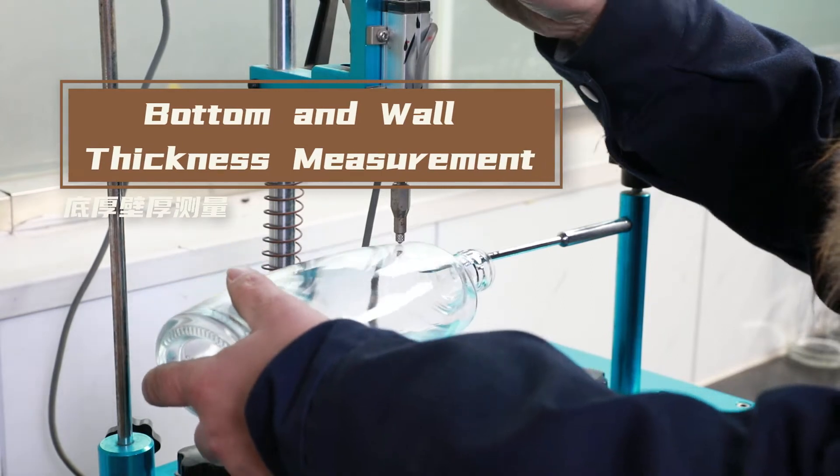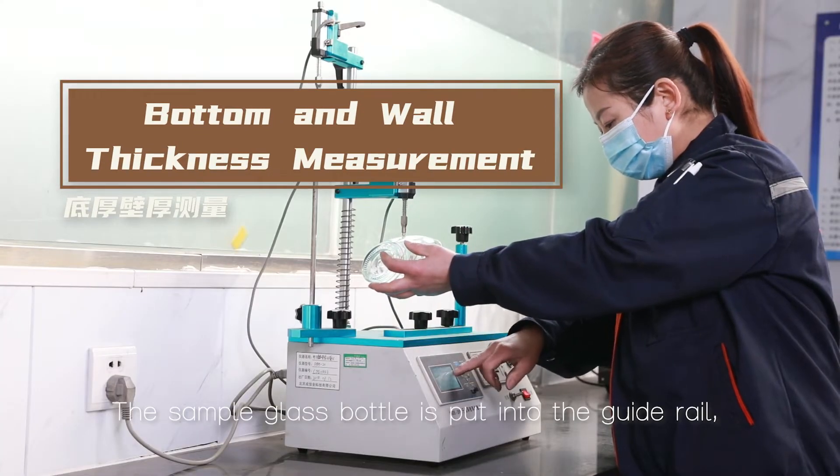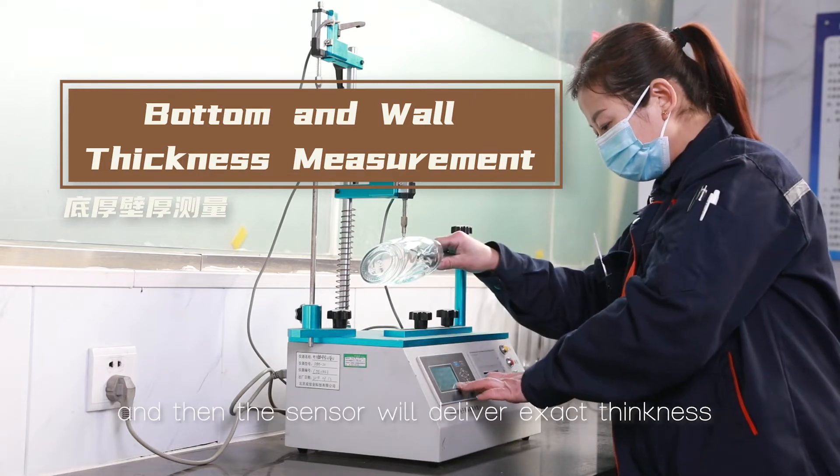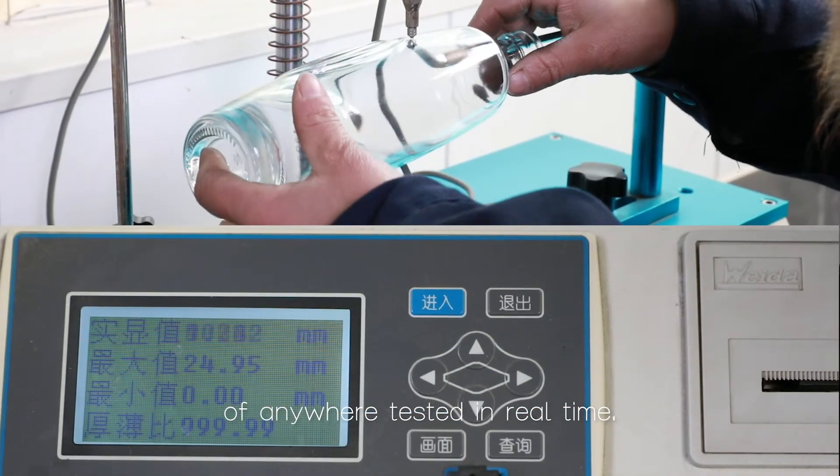Bottom and wall thickness measurement. The sample glass bottle is put into the guide rail, and then the sensor will deliver the exact thickness of anywhere tested in real time.